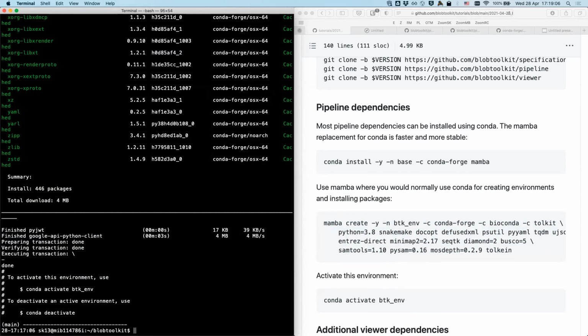Sorry, it's still loading Mamba. Oh my, wow. Okay, that's just conda being difficult then. Right, you might have to just watch in that case. Oh, Aurelian, can I just ask? Hey, yes, I had the same problem actually. The loading Mamba was very long, so I just started with the Mamba create command line.